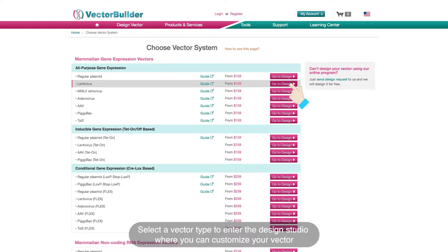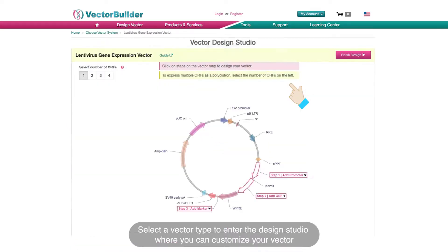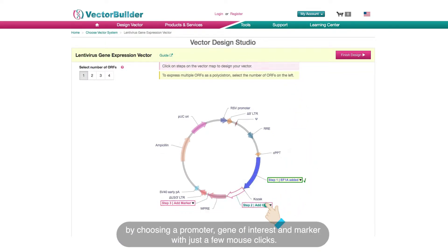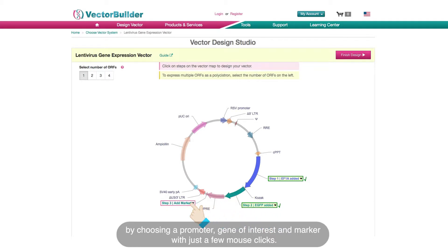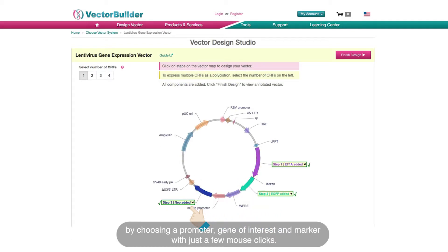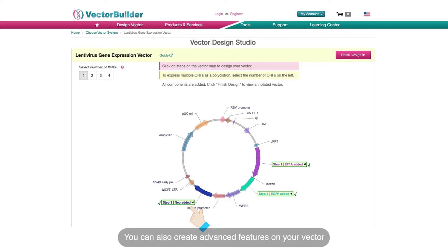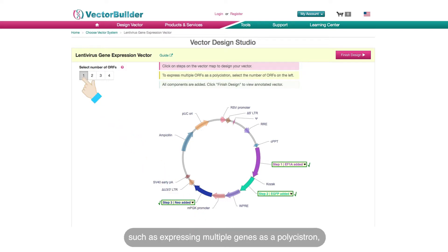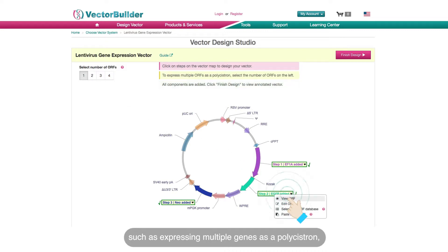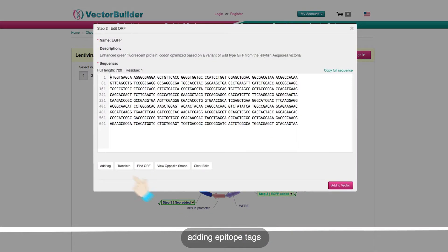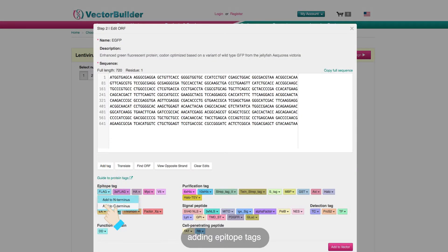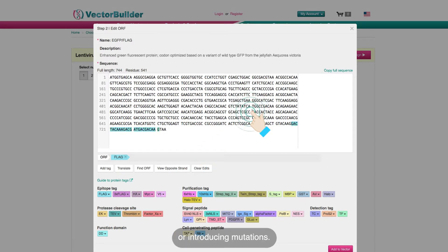Select a vector type to enter the design studio, where you can customize your vector by choosing a promoter, gene of interest, and marker with just a few mouse clicks. You can also create advanced features on your vector, such as expressing multiple genes as a polycistron, adding epitope tags, or introducing mutations.